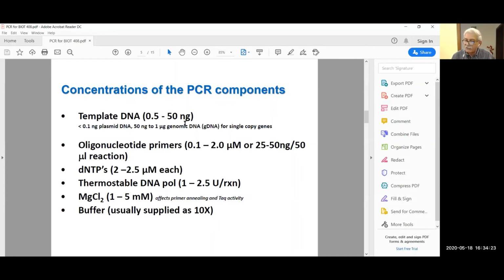Humans have 46 chromosomes and cotton has 54, with a much higher amount of DNA per nucleus. Some other plants, consider wheat, it is a hexaploid. It has a much higher concentration of DNA in its single genome. So you need to calculate 1,000 copies per genome.